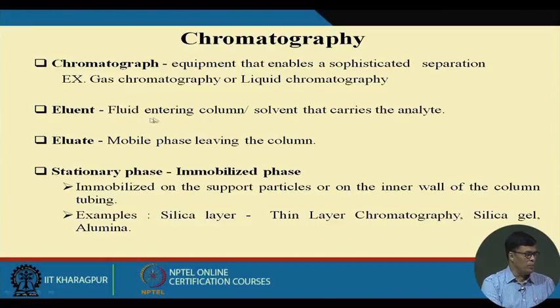Now, the eluent is the fluid entering the column, or the solvent that carries the analytes, and the eluate is the mobile phase leaving the column.